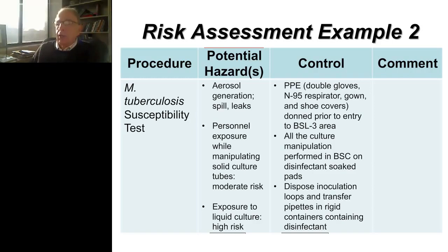That's a higher risk. So you have your PPE listed again, working in a BSL-3 laboratory, or some people use BSL-3 precautions while working in a BSL-2 if they don't have that available to them. That can be considered as well. All culture manipulations are performed inside a biosafety cabinet on disinfectant-soaked pads.